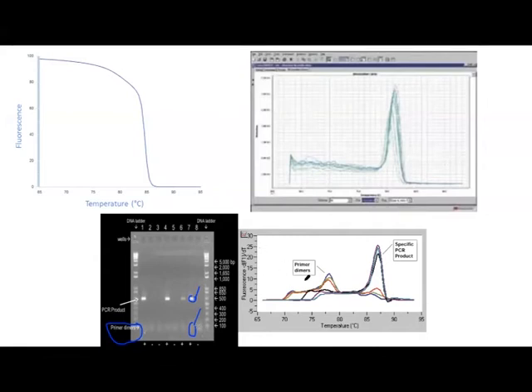So whenever you run melt curve analysis, it can tell you whether your primers are good and give specific products. You're going to get this kind of graph. Whenever you get a double peak, this is your specific PCR product, and you get a peak at a low melting temperature, and these are your primer dimers. This means you have a very bad primer design, or the concentration of primers is not good. So you need to rerun your PCR using a different setup and different primers. That's what the melt curve analysis can also be used for.